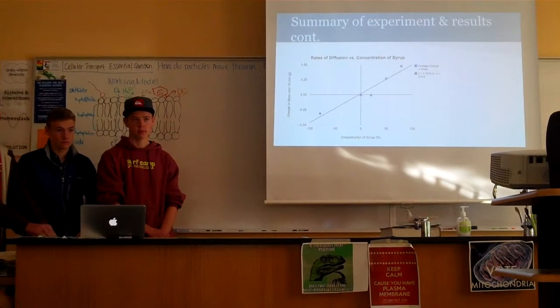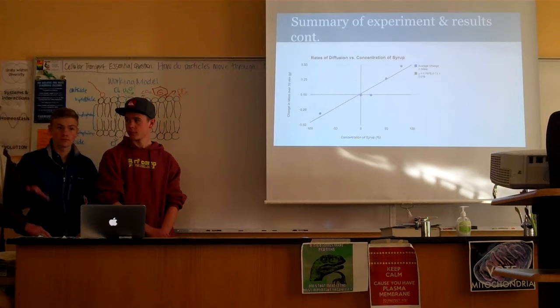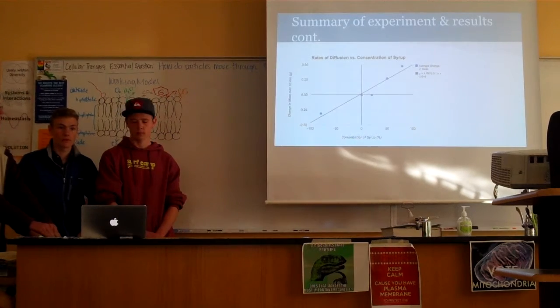And why does that make sense? Because the water wants to travel faster to balance it out, to reach isotonic.